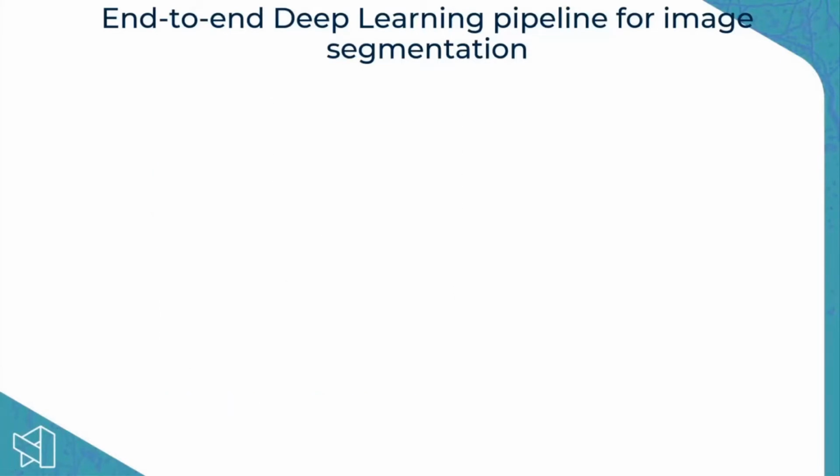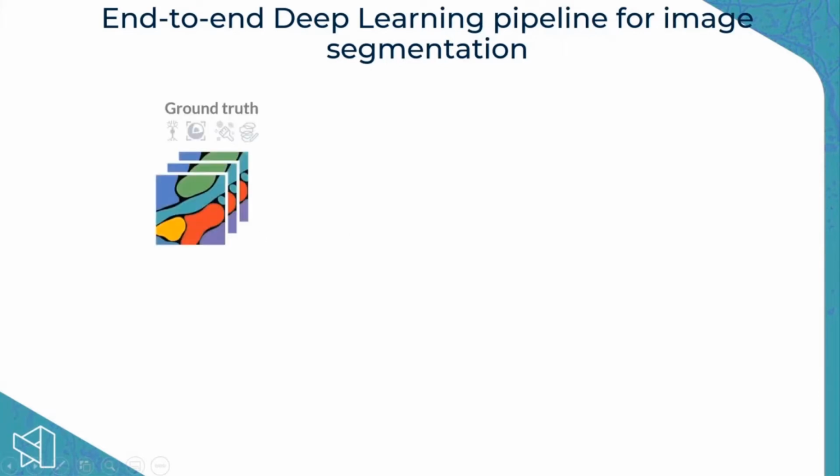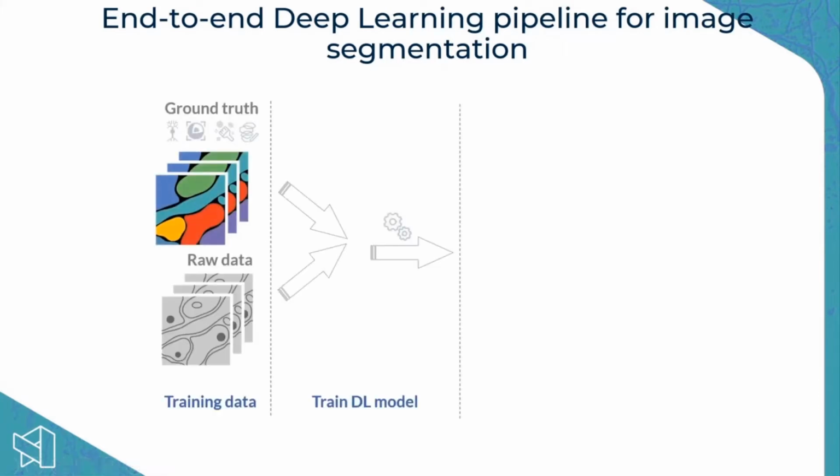So we use deep learning. We use deep learning in a range of applications and machine learning in a range of applications as well.